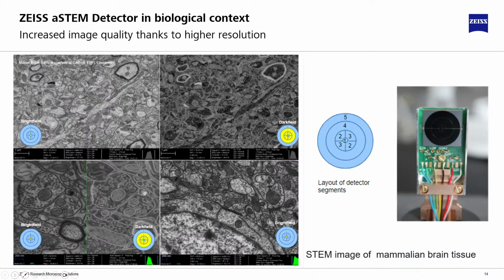Okay, this is how the images of the STEM detector look, and these are the different areas that we have from the STEM detector. We have up to 5 different areas. You can click on these areas and activate or deactivate different setups or conditions on your detector.